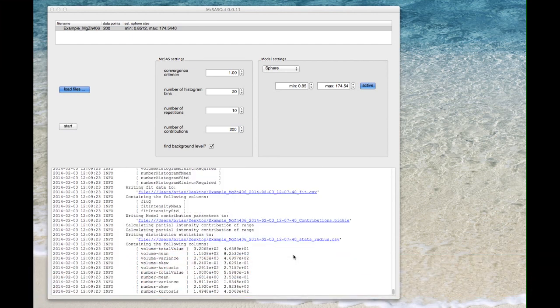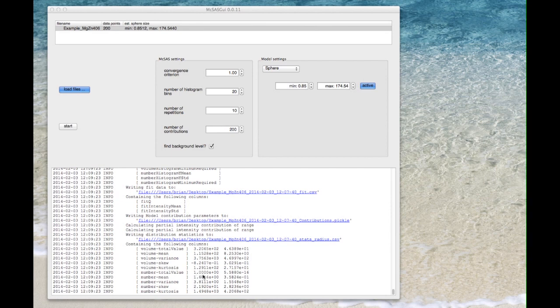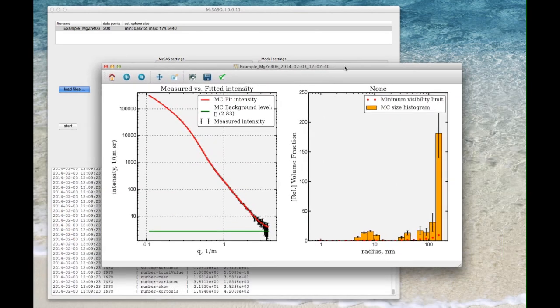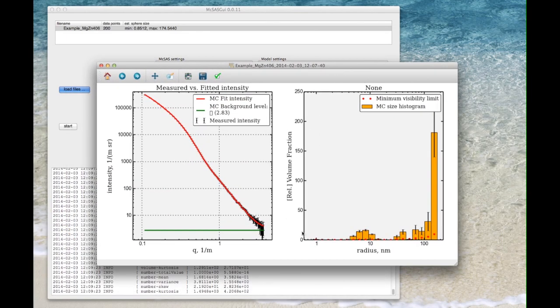So at the end of the Monte Carlo process we see that it's completed successfully in this window here. The results window should come up which looks like this. We see on the left hand side here the measured versus fitted intensity.